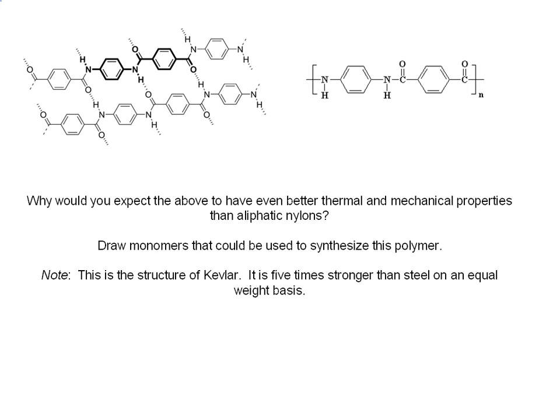Okay, those are some high points, some highlights of this week's lab, where you're going to be making nylon 6,10, and good luck.